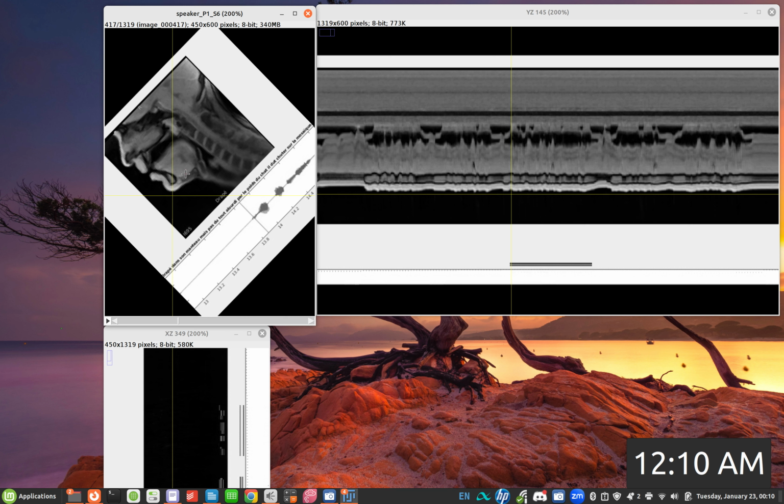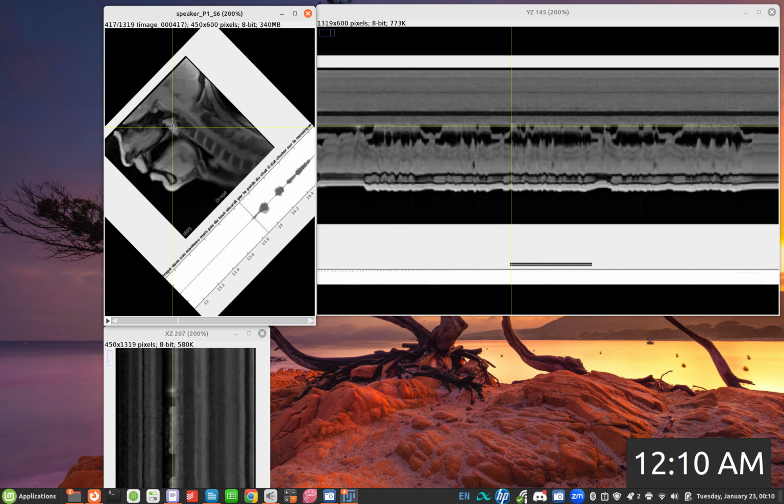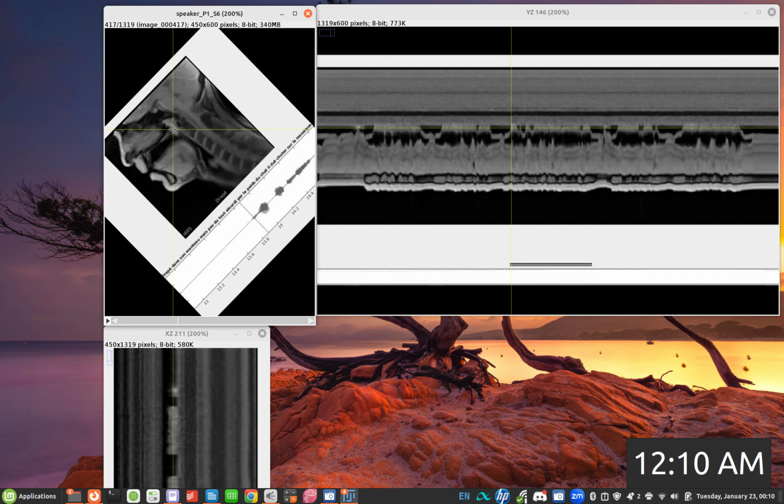All right, so this looks like a good estimate, but if we like, we could move it a little to the right. Yeah, this sounds pretty good to me. So it is capturing the seal very well. That means during the seal we don't have any black pixels. Okay, so the horizontal line is not of our interest.